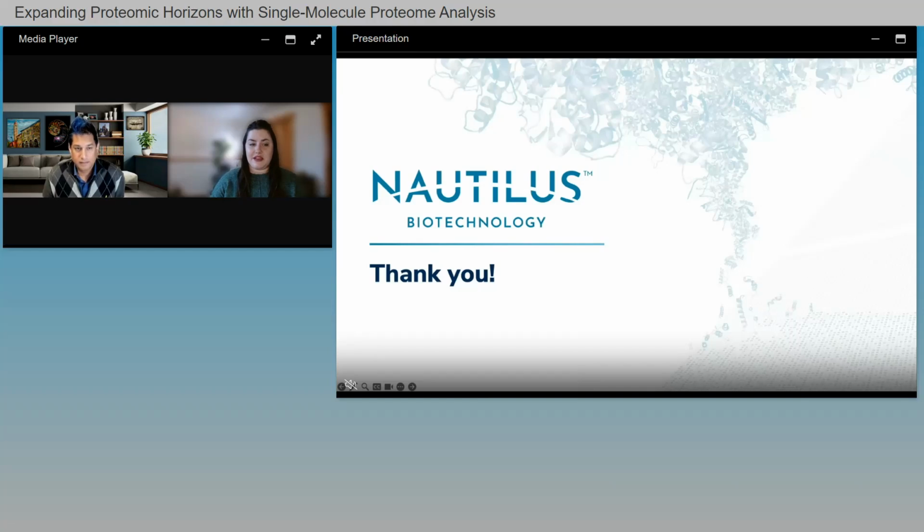Okay, great, thank you. All right, and we have time for maybe just one more question, so I'll go ahead and ask this one. This asks, how is the technique altered if the probes recognize more than 3 to 4 amino acids? So it really isn't.